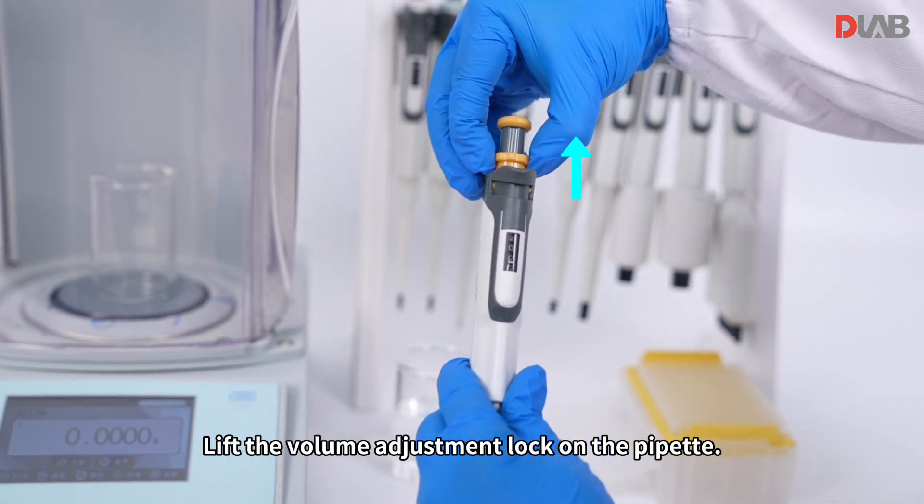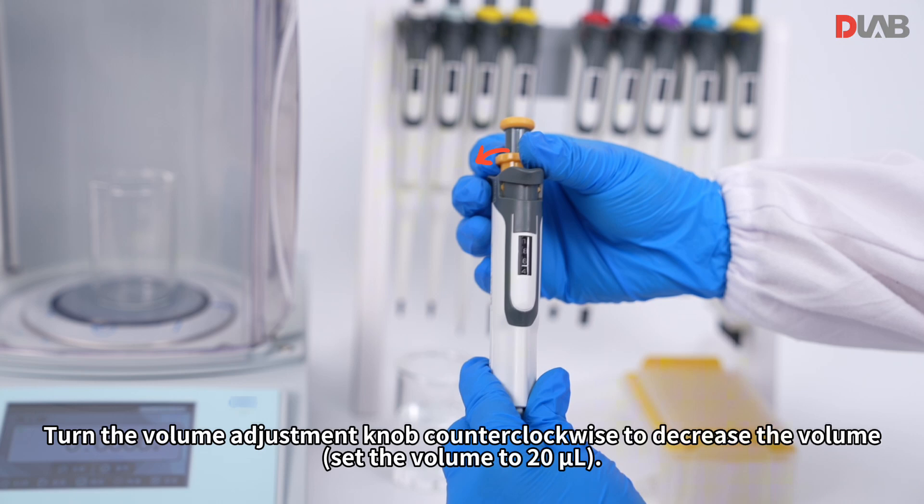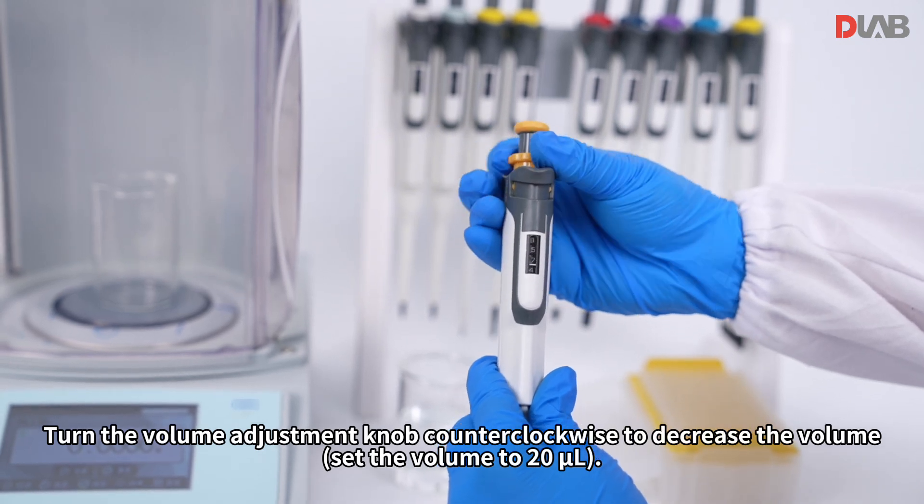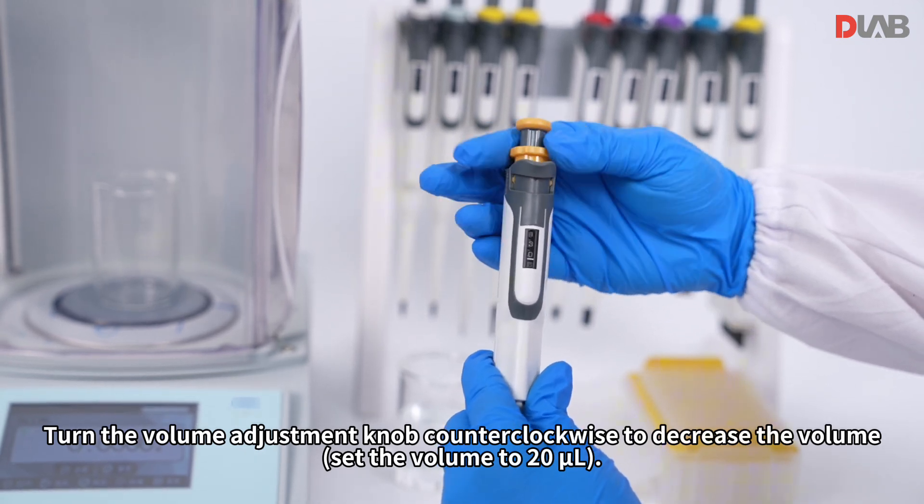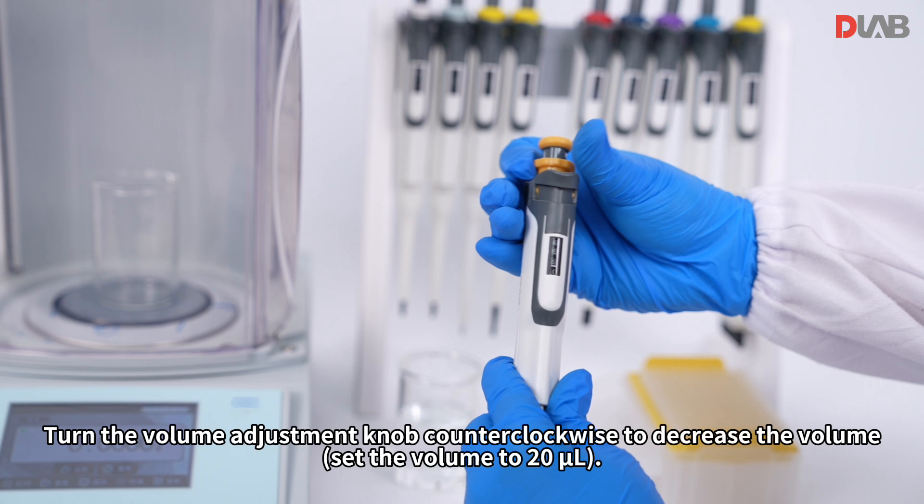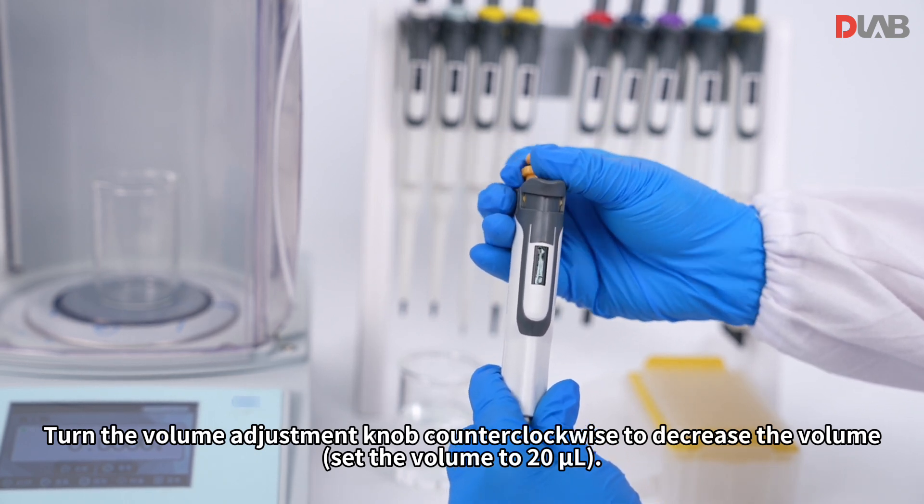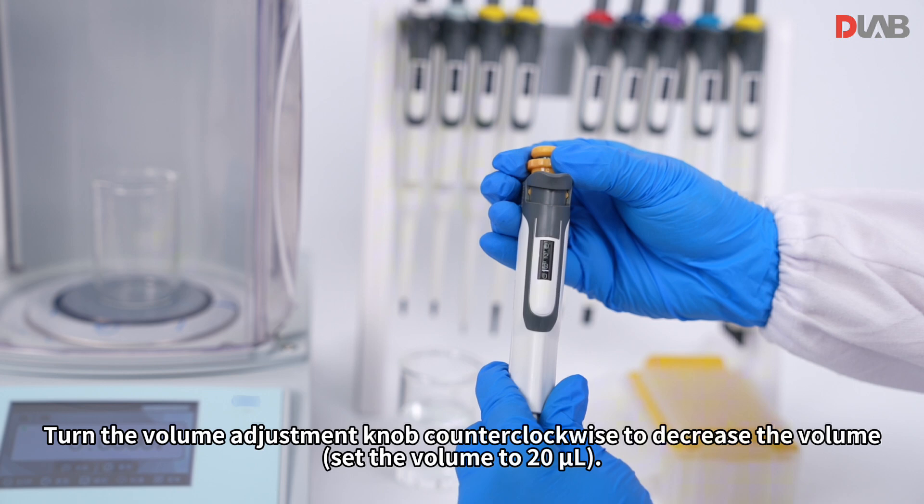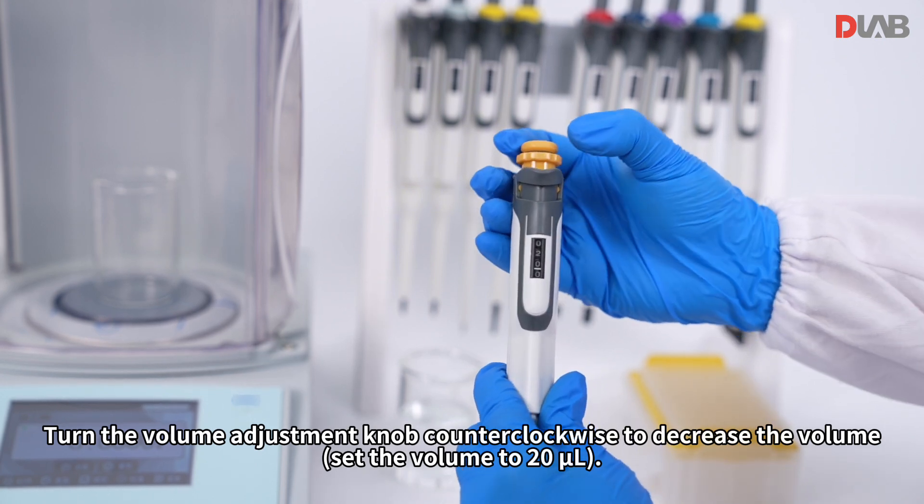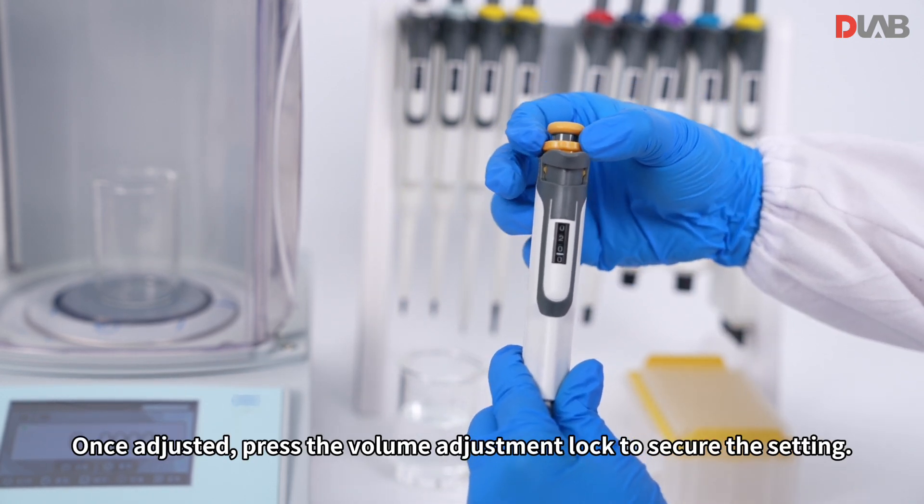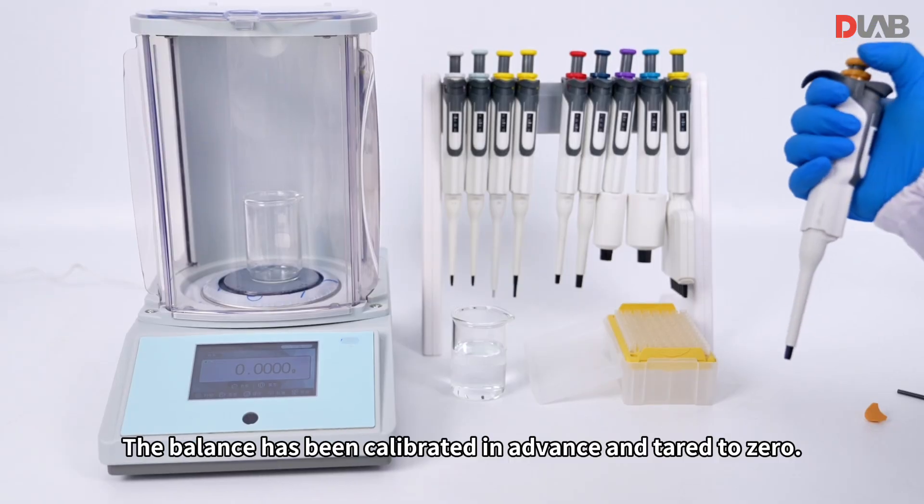Lift the volume adjustment lock on the pipette. Turn the volume adjustment knob counterclockwise to decrease the volume. Once adjusted, press the volume adjustment lock to secure the setting.